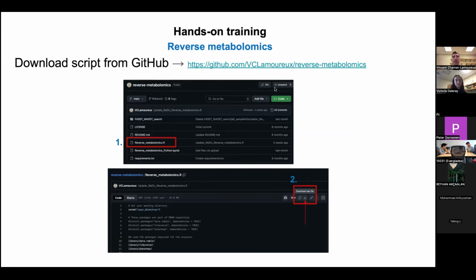Here on the GitHub, if you use that link, it should lead you to that interface. The link is also in the chat, and Shipe and Victoria just sent the script here that you can download and then open in your RStudio interface.